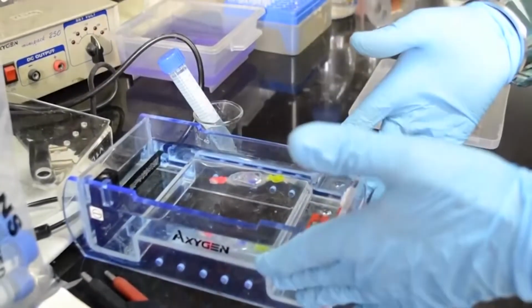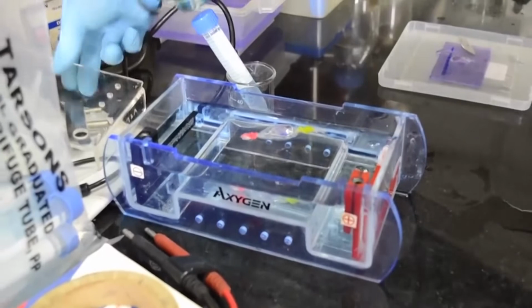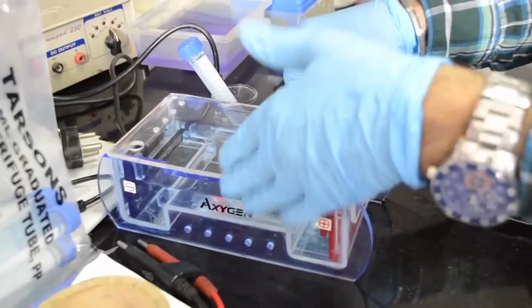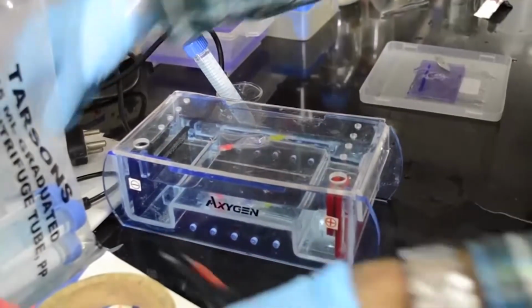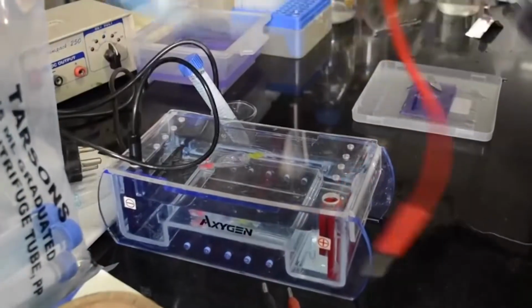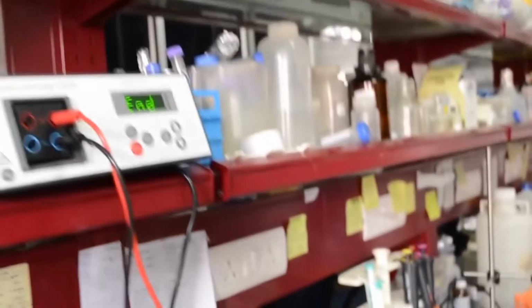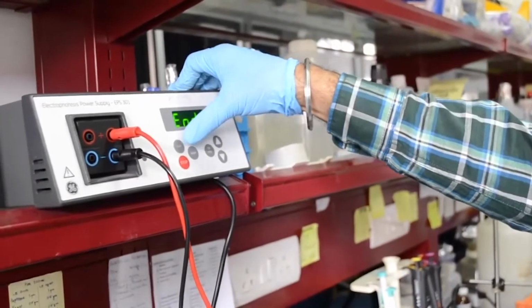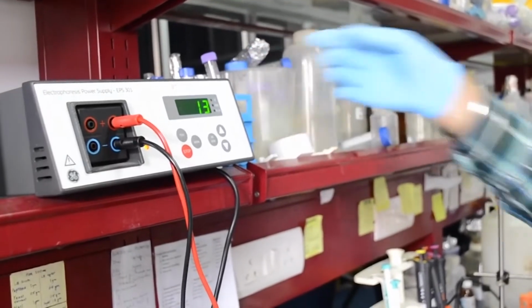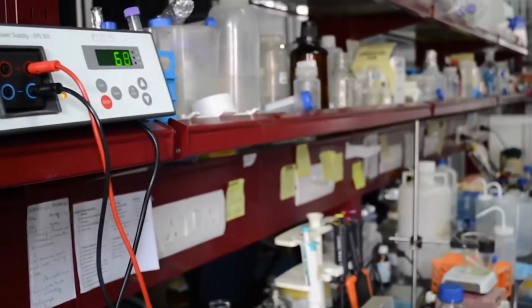Fill it with the buffer. It doesn't matter what buffer you use, but it should be conductive so that the current can flow. Then you can just close this and connect it to the cathode and anode, so you connect to the black and the red. And now you just run it on 100 volt. You can run it on 80 to 100 volt.